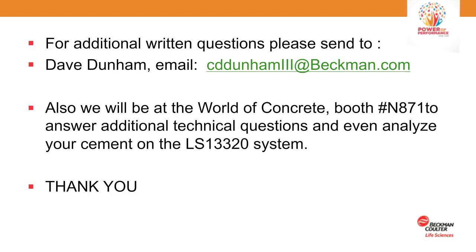You get 10 cups with the instrument, and you can just constantly feed, and the data is automatically being saved, so it's almost as fast as you can feed samples to it and tell it to operate. It's not difficult to do a very high number in an 8-hour day. You're probably talking about a max of 30 to 40, 45 samples an hour.